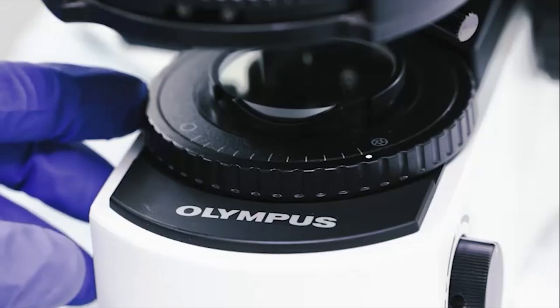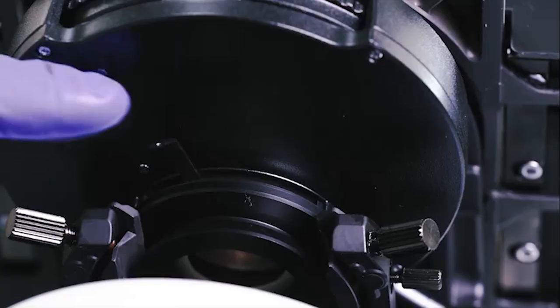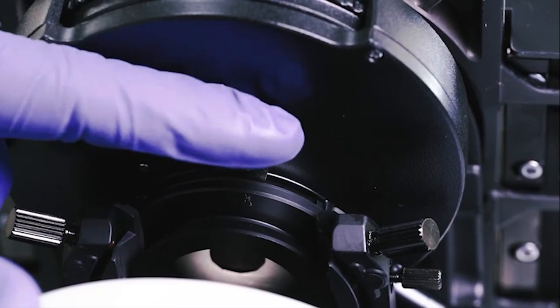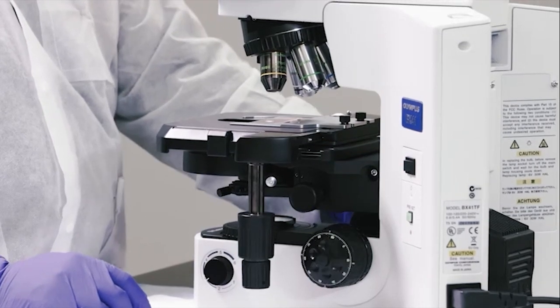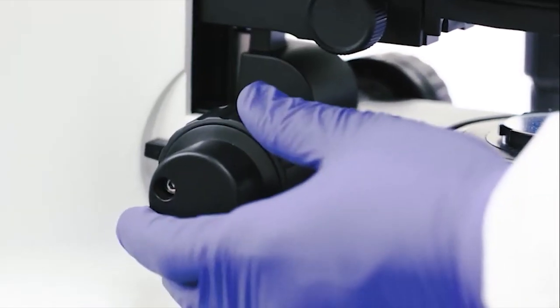Open the field diaphragm all the way and close the condenser diaphragm all the way. Move up or rack up the stage to its highest position using the stage controls.